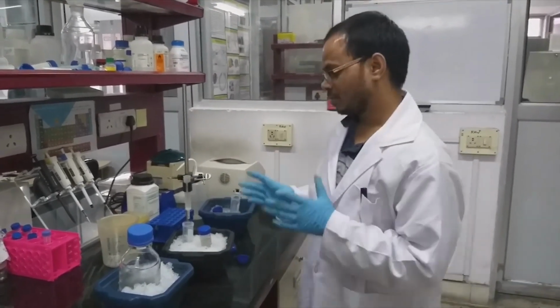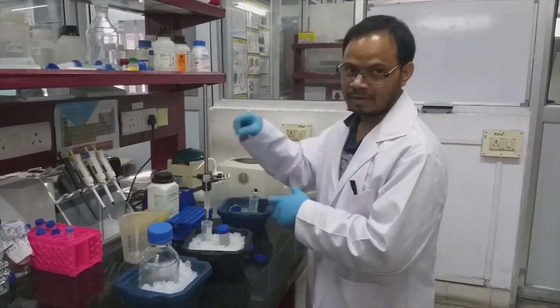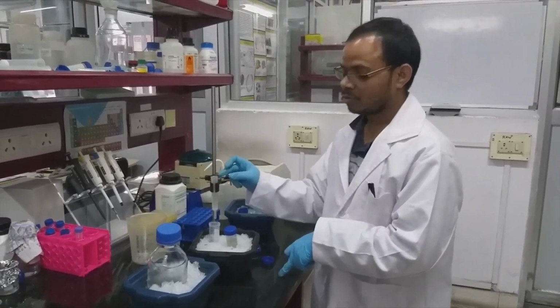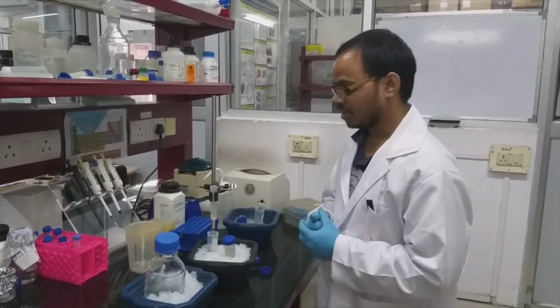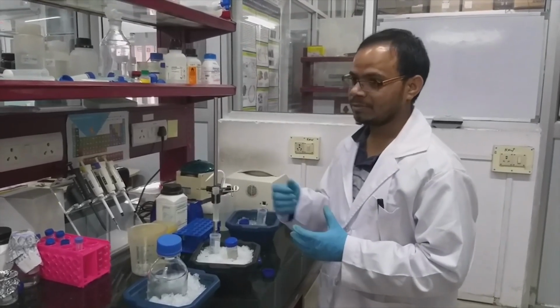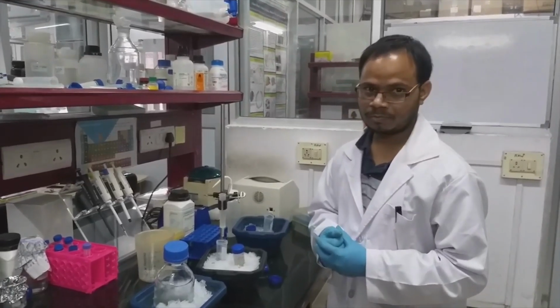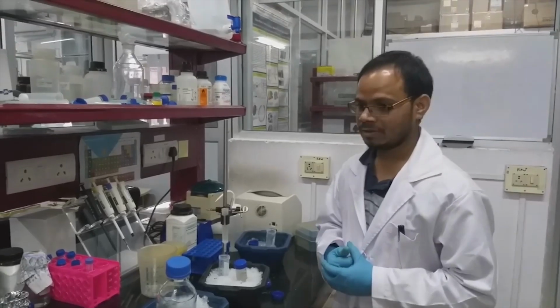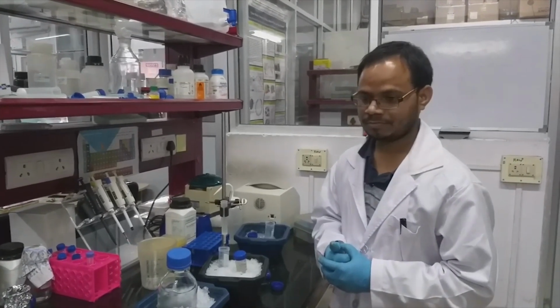Before doing this, we have to observe the beads. We should not directly load onto beads. You just have to pour through the corner, through the wall of the column. Otherwise, it may disturb the beads, so the protein may also degrade. So this we have to keep in mind while doing this washing.